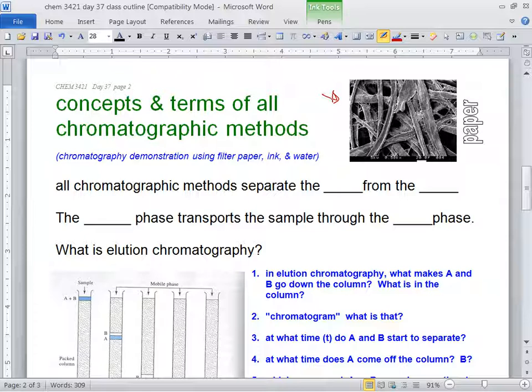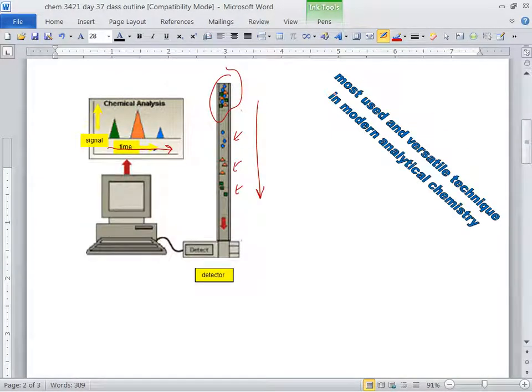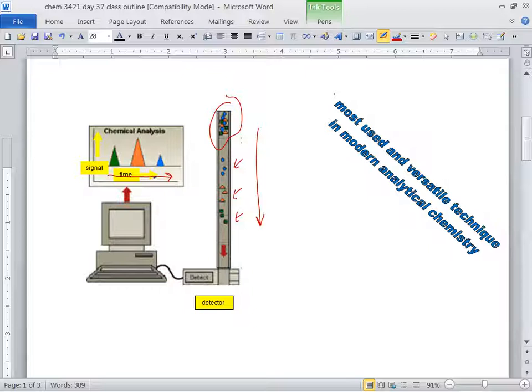Now I'm going to be dumping water in those beakers. What's the difference between what the mobile phase is doing, what I'm going to do, and what the mobile phase is doing here? It's traveling down this, maybe traveling up. Yeah. In this one, I'd have to be sitting there with the beaker or whatever and keep dumping it on top. Constantly dumping. Here, I'm just going to dump it in the bottom down here, kind of get it up to the paper. Then what? The paper absorbs the water, yeah.